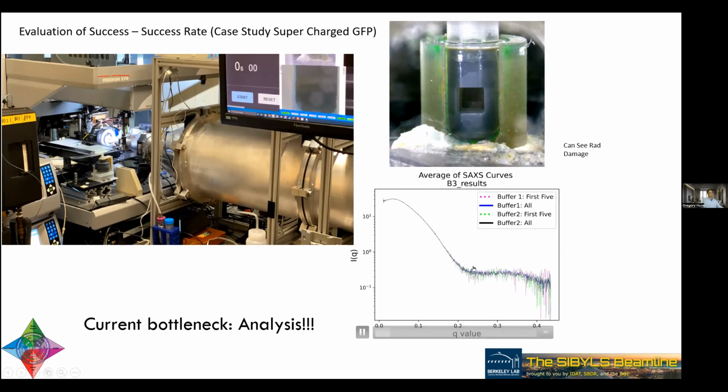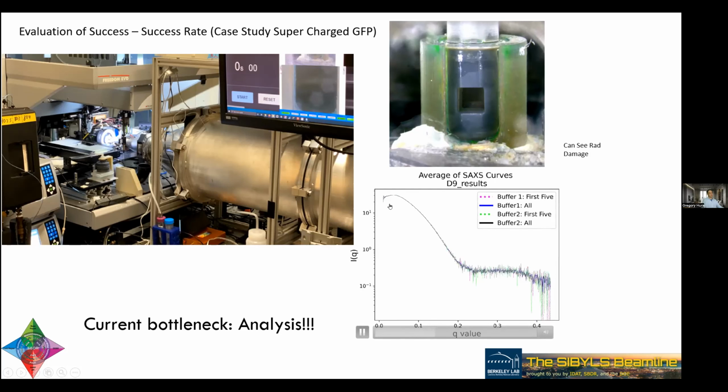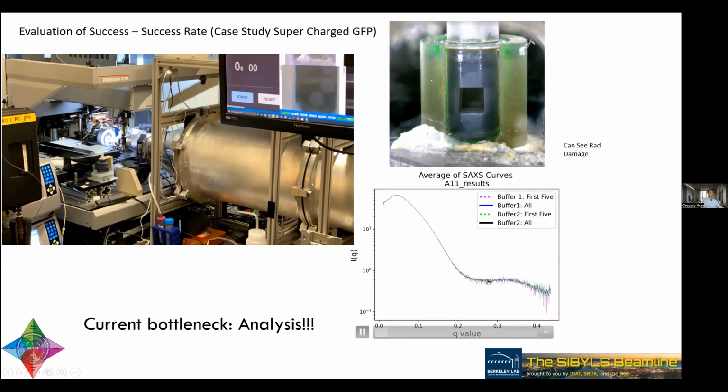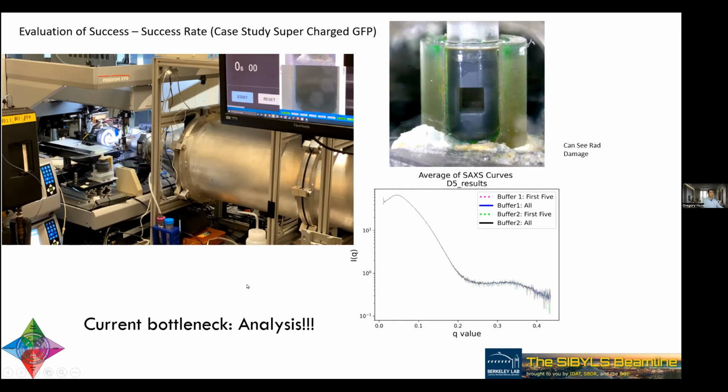these are the quality of the data that you'll see. GFP has a repulsive component, so you'll see not your standard SAXS curve, but structure factor data there. And you can imagine that changes as a function of salt, which is part of why we're interested in it. We usually ask for buffer before the sample and after the sample, so you'll see some discrepancies in the high Q. But generally, the system now works pretty well, and good quality data. Data in quantity and quality is what we've been aiming for.